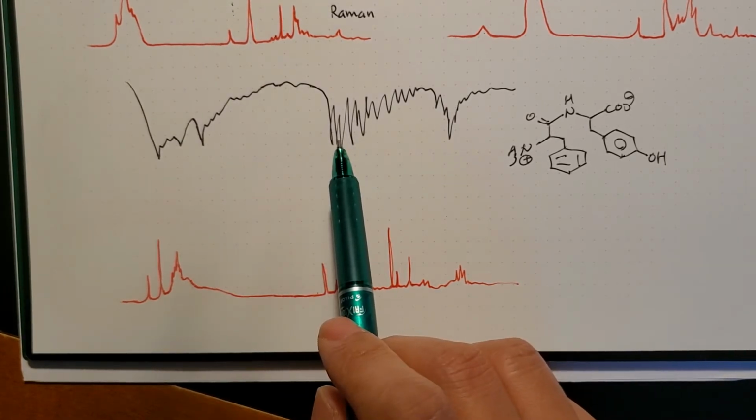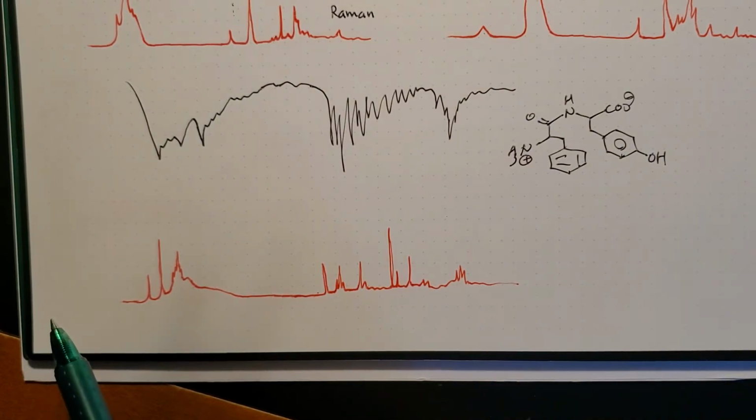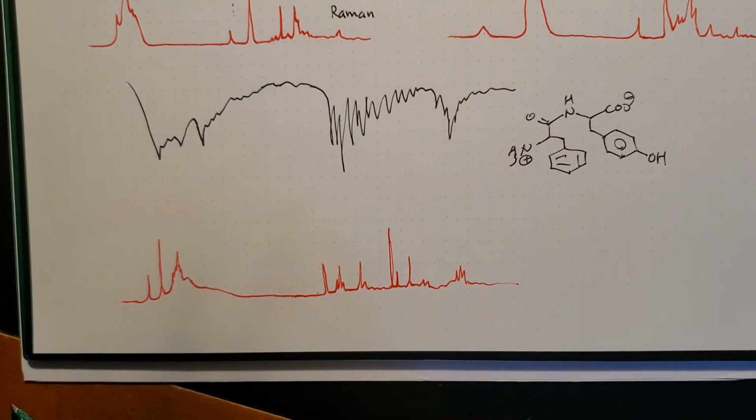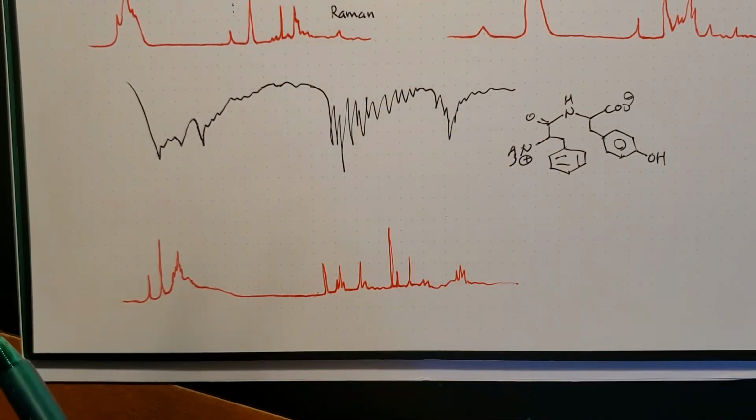And here it's very busy with the carbonyl groups, a couple of different carbonyl groups, and a lot of carbon-carbon double bonds, and even the CN double bond. There are partial double bonds there, right? And a variety of busy signals coming in.